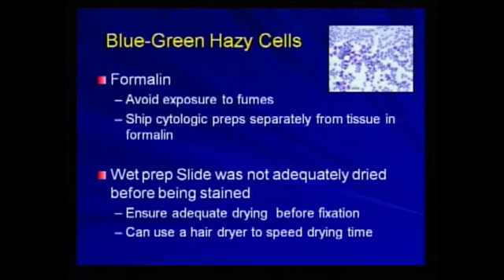Now, one of the things that will ruin your cytologies quite readily is exposing them to formalin fumes. It is a very bad idea to package aspirates, air-dried aspirates, in with necropsy material from the animals, because generally it develops a greenish blue. They don't stain properly, and they don't take up stain very well. So everything has a greenish blue haze to it.